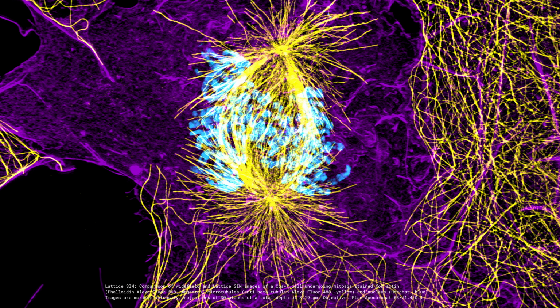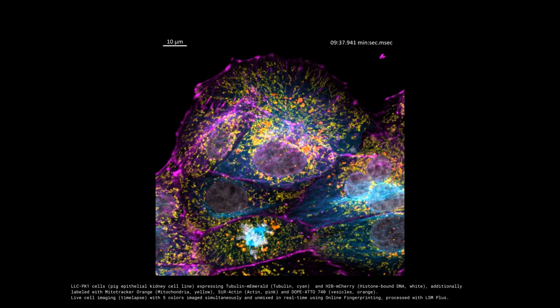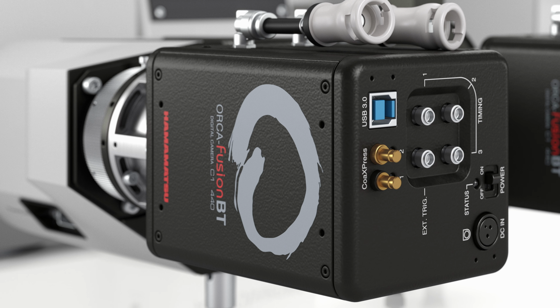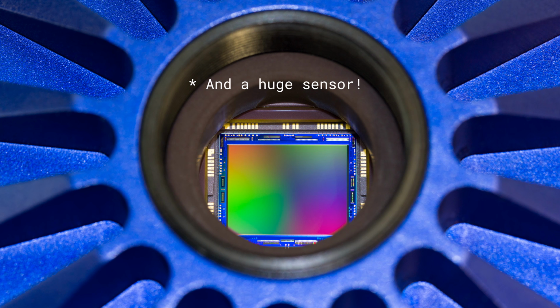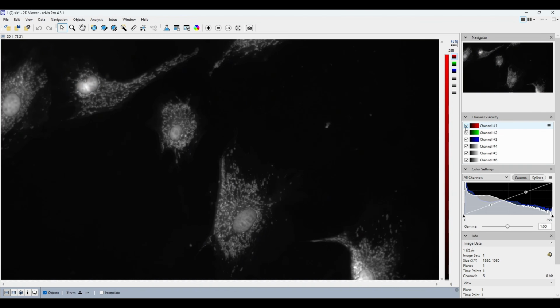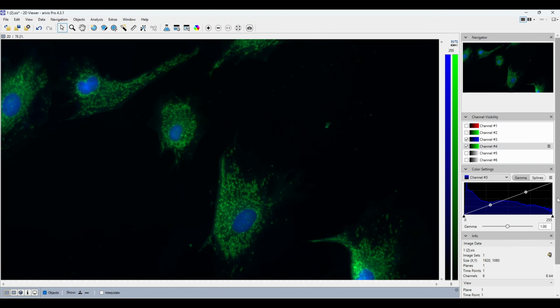Multi-channel fluorescence allows us to capture images from several dyes simultaneously. Because fluorescence signals are usually weak, we often use high-sensitivity monochrome cameras with cooling and low noise. Each image corresponds to a different dye channel, usually blue, green or red. After acquisition, we assign colors in software like Photoshop or special microscopy software, overlay them and get those famous multi-channel composite images.